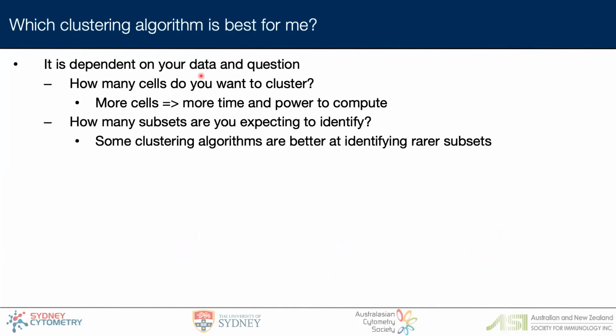So when considering these kinds of things, obviously we have to start thinking about which clustering algorithm may be best for you. And this is always dependent, like everything else, on your data and the question that you may want to answer. So some things to consider here, probably the most practical one is the number of cells that you want to cluster. The more cells that you have greatly increases the time it will take, and this is also dependent on the power of your computer.